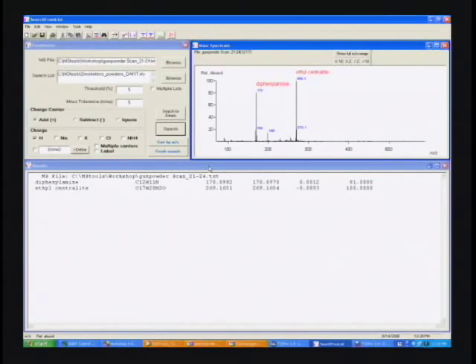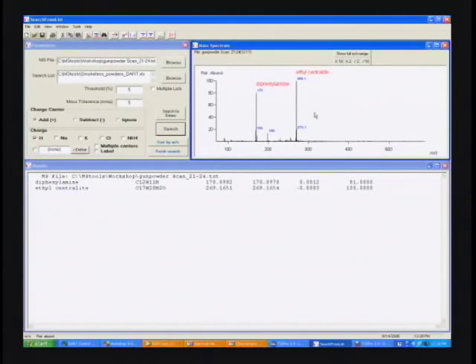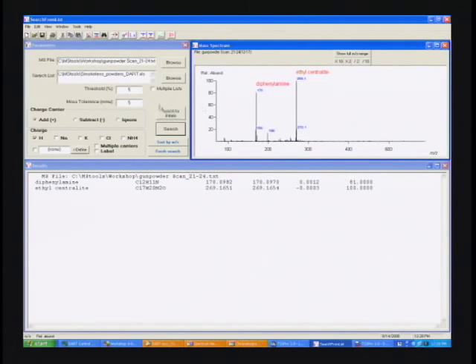What they were: diphenylamine and ethylcentralite, and both of these are well-known additives in gunpowder. So we've got a fingerprint of the additives in the gunpowder that can be used together with other information such as morphology or infrared to identify which gunpowder particle we're looking at. Remember, this is just a tiny little gunpowder particle but we've been able to identify quickly what the two components are in it. Let's go ahead and try something different.